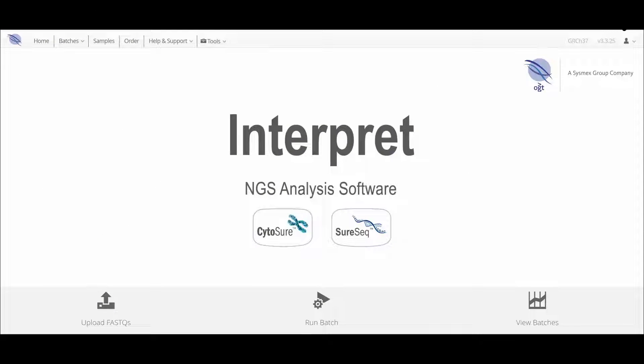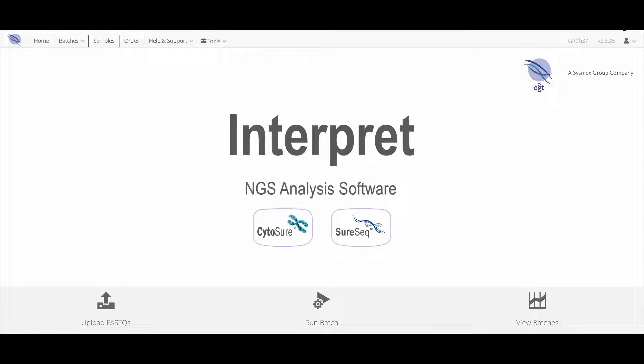Analysis of next-generation sequencing data generates a large amount of QC metrics. In this video, we're going to see how the Interpret software creates easy-to-navigate displays of QC metrics to help the user assess the performance of their sequencing runs.